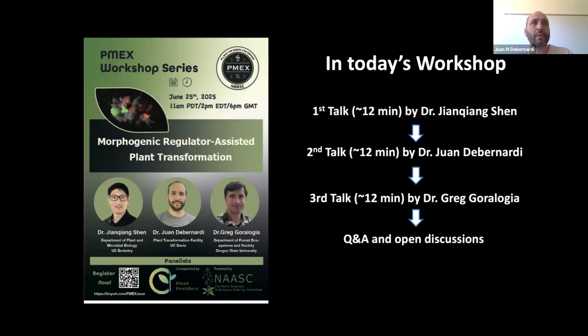But there is an example, Andrea Gallavotti in maize. He combined Baby Boom with GRF-GIF, and he also observed synergy. I know that people from the University of Florida are using PLETHORA 5, which is a Baby Boom-like gene, together with GRF-GIF with good results. So if it is up to me, I will test combinations and every tool that I have, and most of them are now available at Addgene.